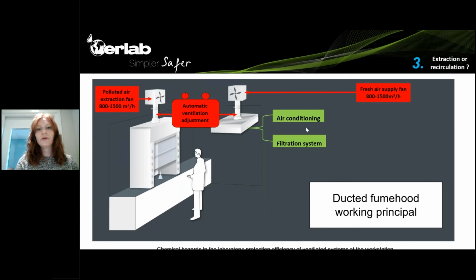So as you see here, there's a fresh air supply fan that will bring back the same amount that has been extracted inside the lab. It can be warmed or cooled down, depending on the country and on the season.